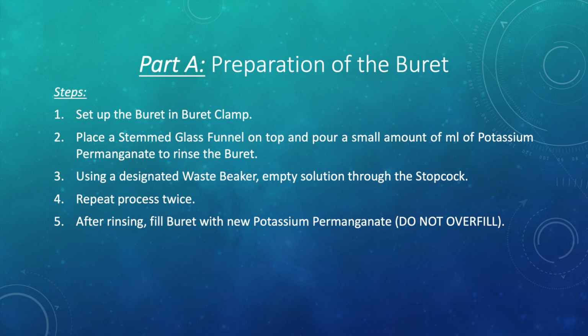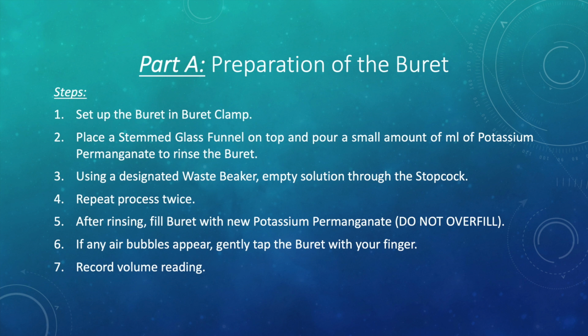And after rinsing, fill the burette with new potassium permanganate. Make sure to not overfill it. And if any air bubbles appear, gently tap the burette with your finger. And make sure you record your volume reading.